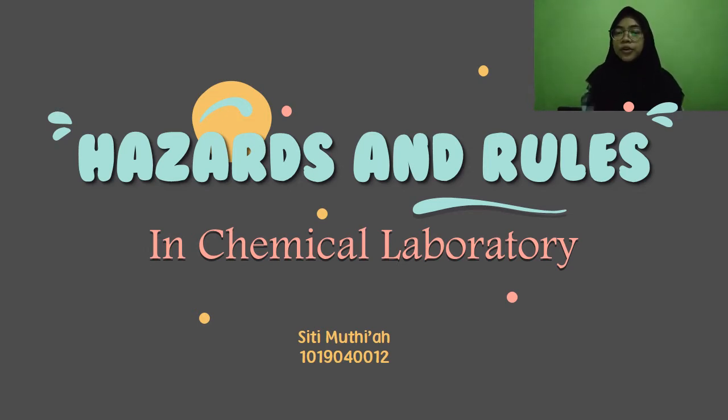I'm from Shipbuilding Institute of Politeknik, Surabaya. My major is Waste Treatment Engineering, and I'm in class 3A. This time, we will talk about hazards and rules in chemical laboratory.